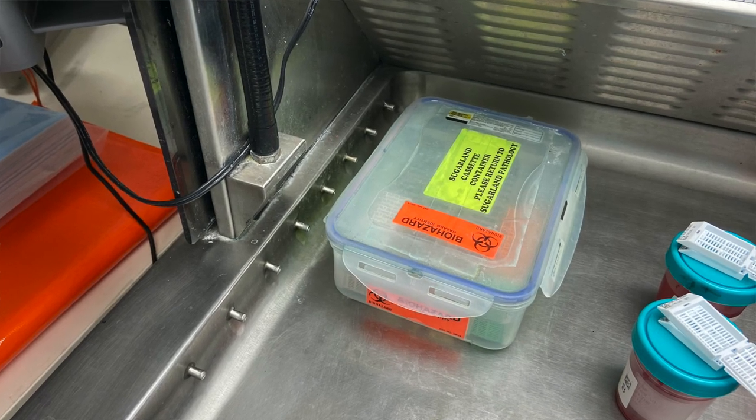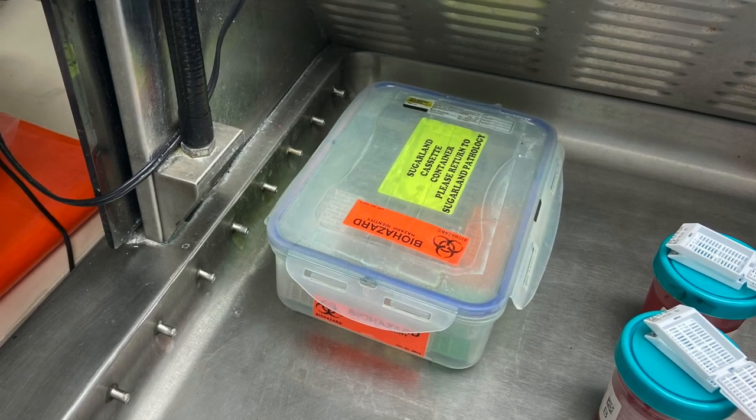The container you put your blocks in — we use a little Tupperware container with a rack in it. Keep the lid on that as much as you can. Obviously you need to leave it open to put blocks in, but don't just leave it open and walk away. That kind of stuff can add up over the years.